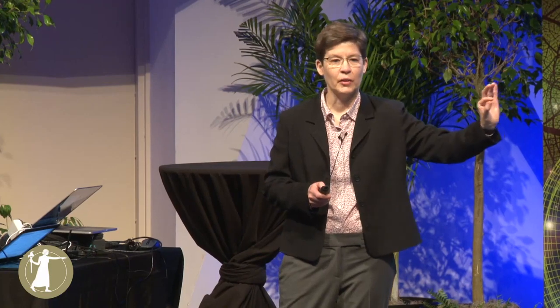And for soft materials, as the name implies, these are mechanically weak and deformable, and that means they can be printed. So from the perspective of designing inks for the types of printing methods that we do, as you saw in those movies, our inks maintain a filamentary shape when they come out of the nozzle. Unlike the inks that you have in your inkjet printer that break up into droplets and wet and spread due to Rayleigh-Plateau instabilities, we're designing a viscoelastic response into this material.